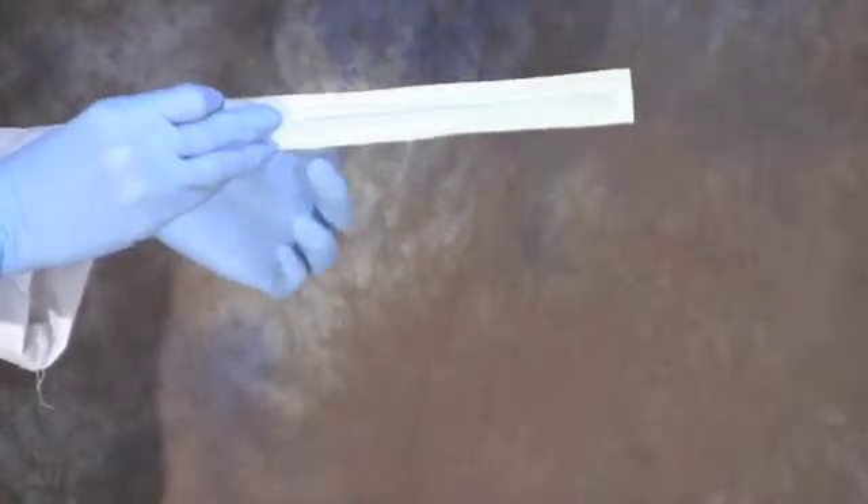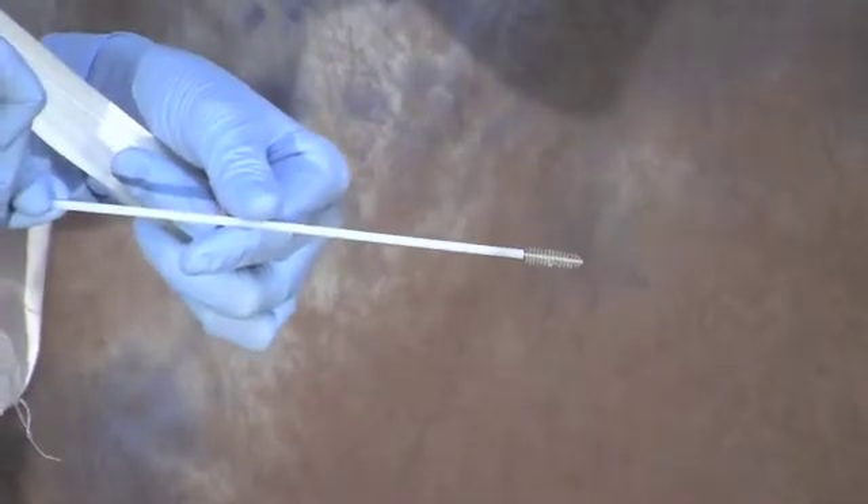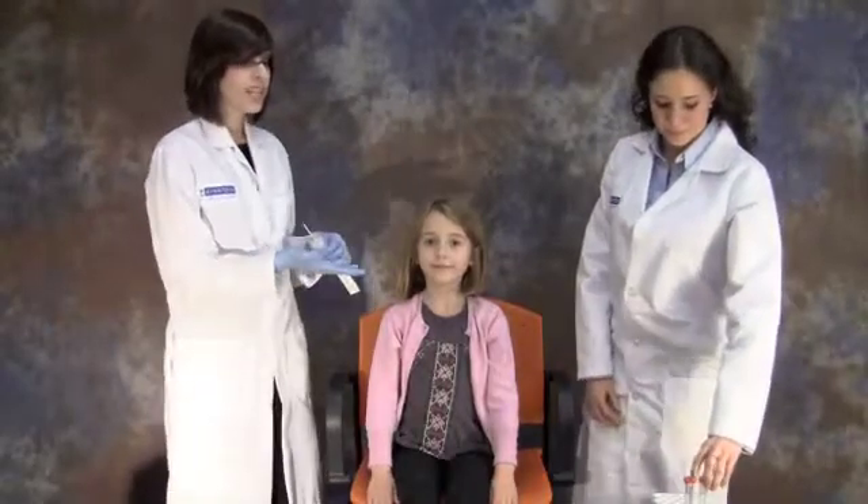This is a soft, sterile cytology brush. It's smaller and softer than a toothbrush. We provided you with the brushes and with tubes that have been pre-filled with a preservative solution.